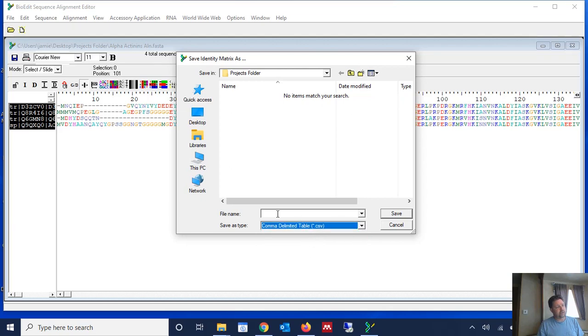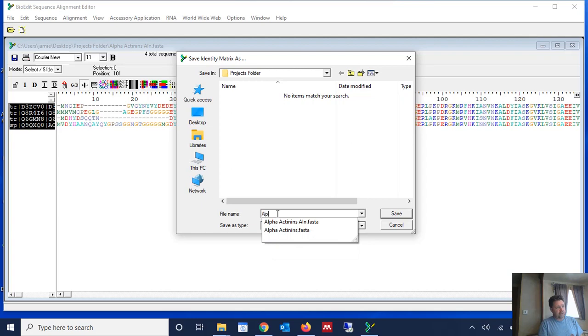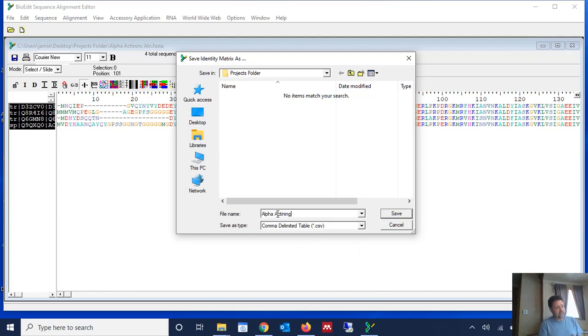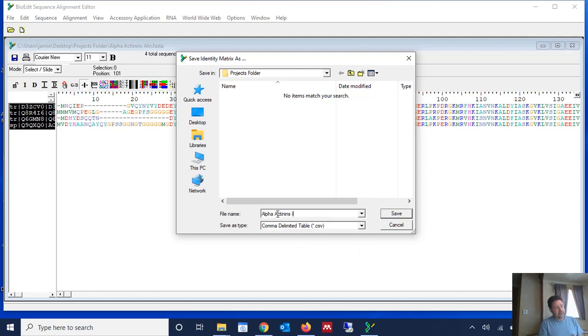So it's a comma separated value file and I'm going to call it, in this case, alpha actinins ID matrix and I'm going to click save.